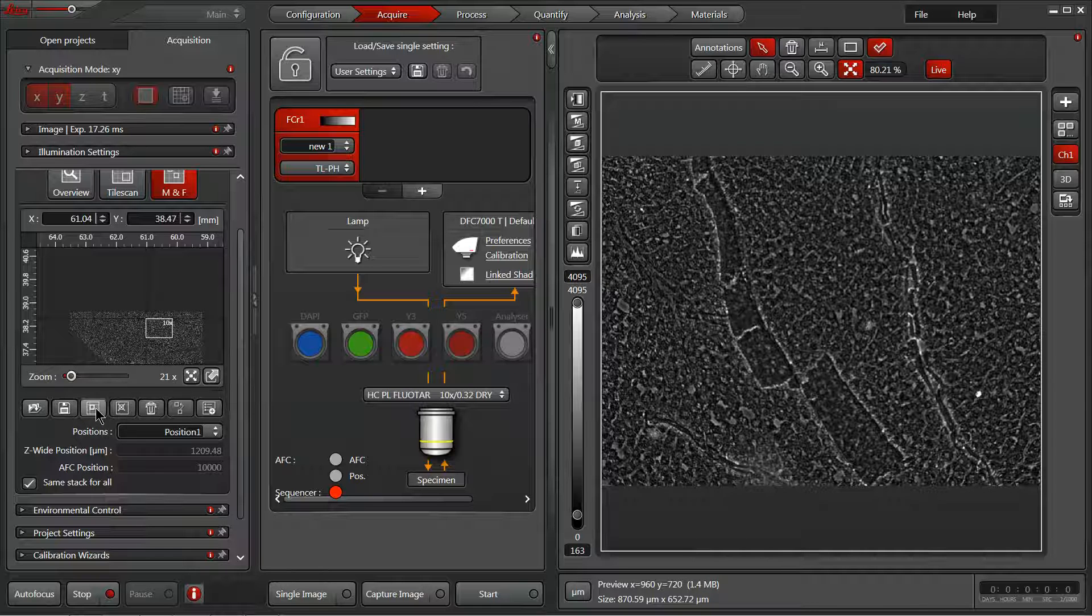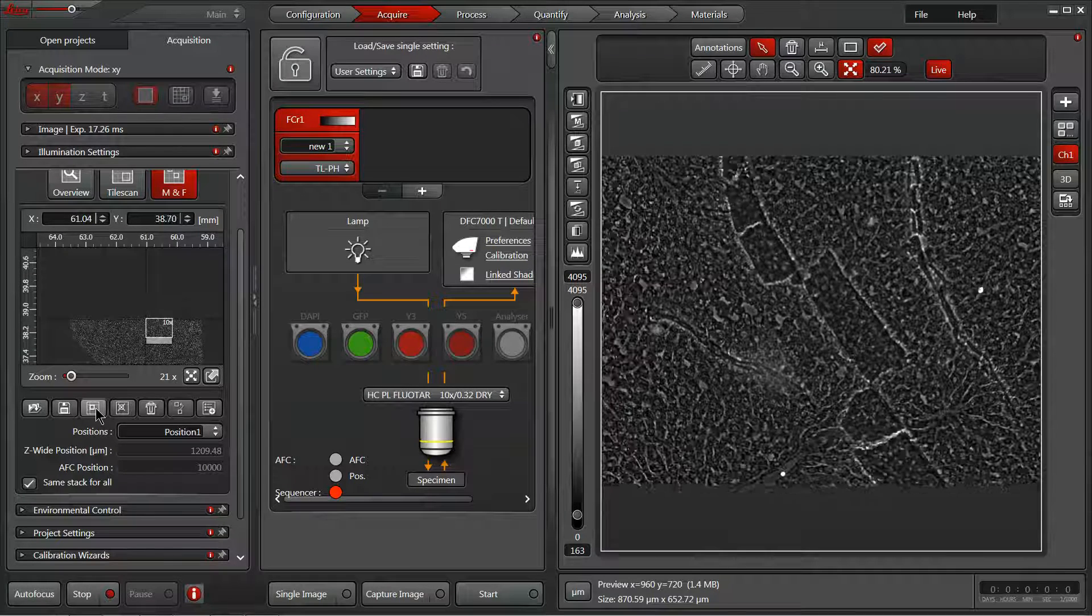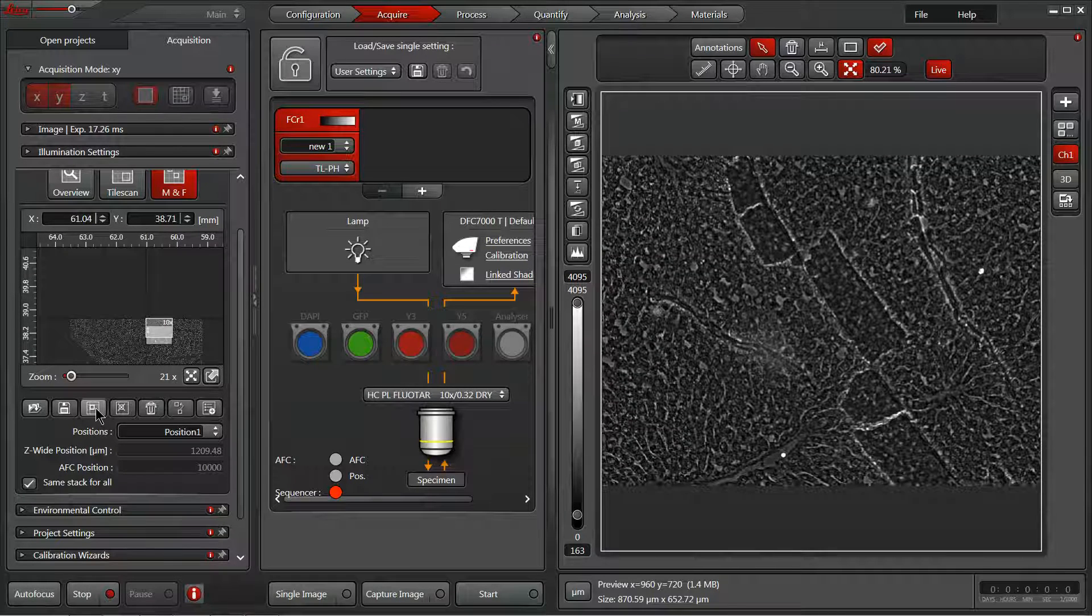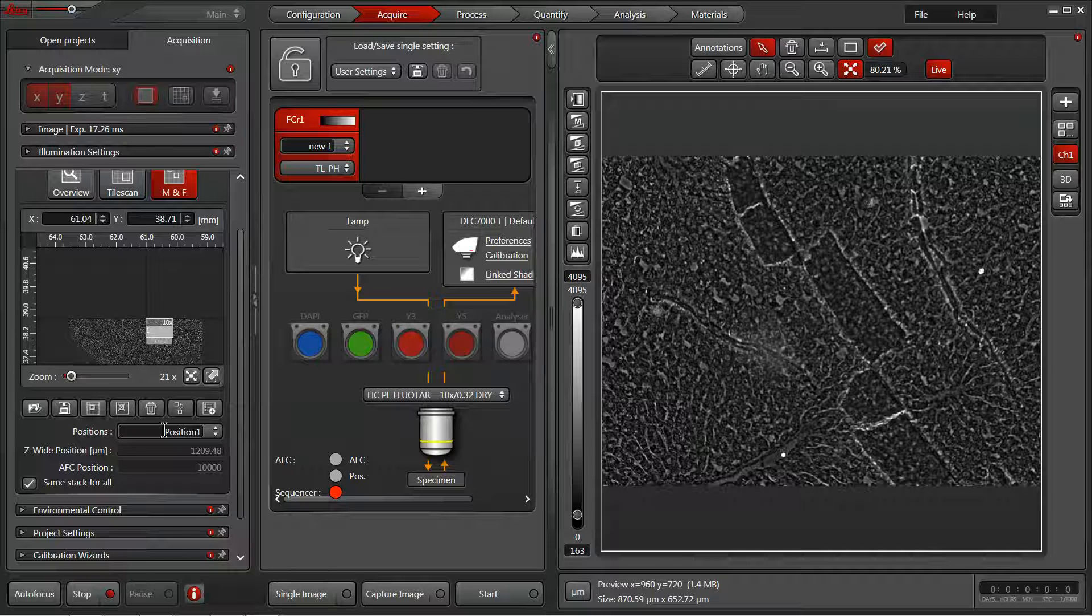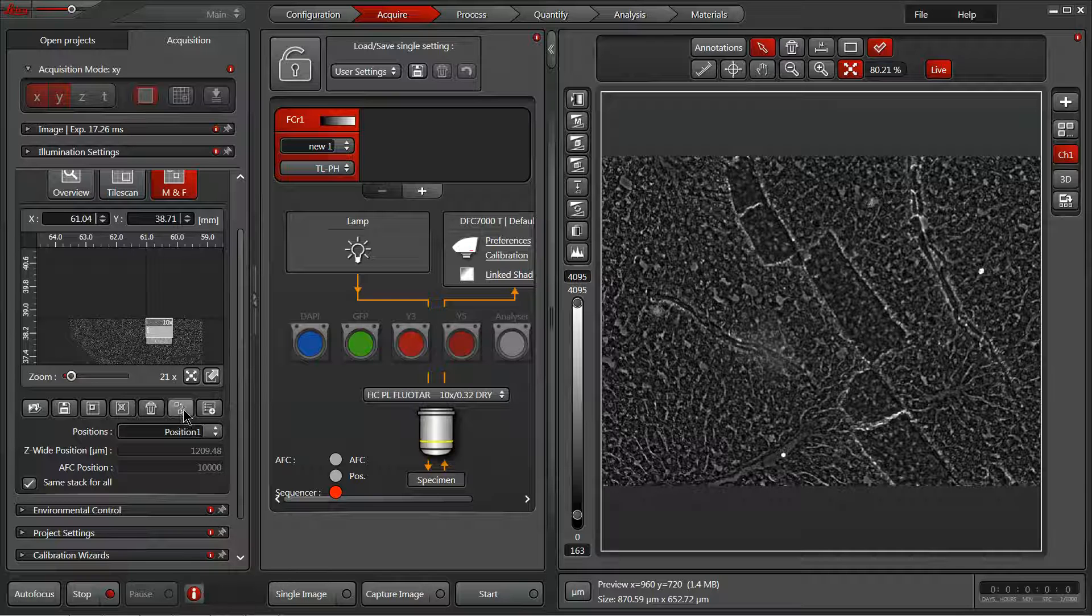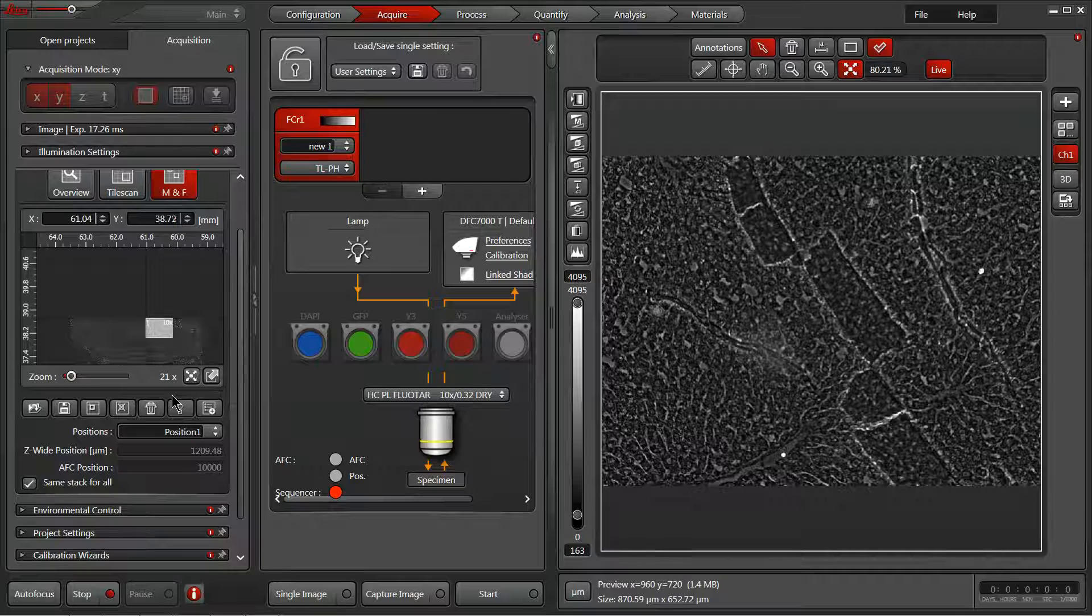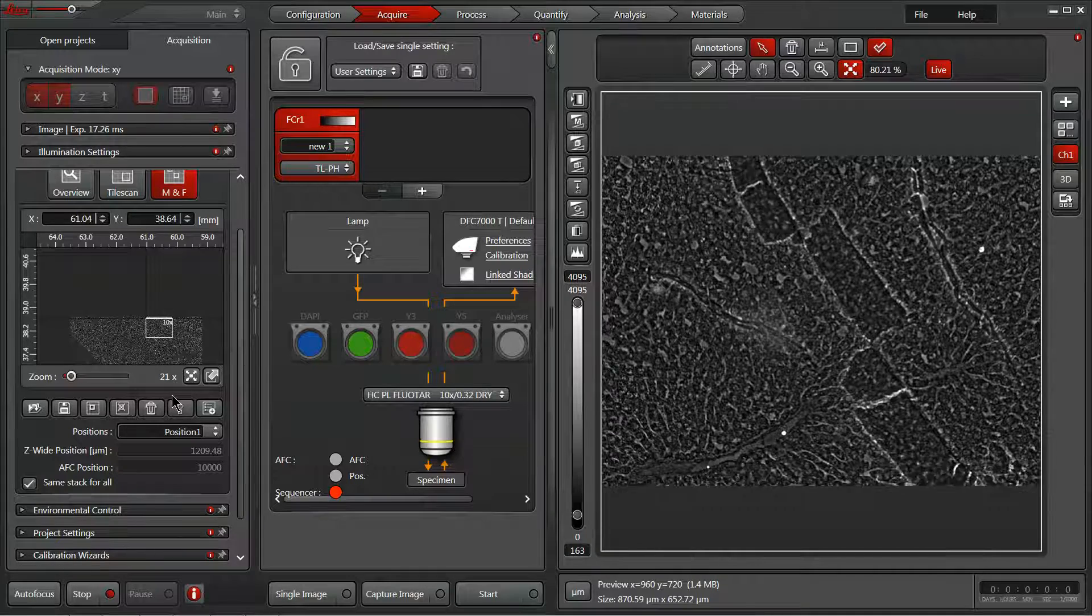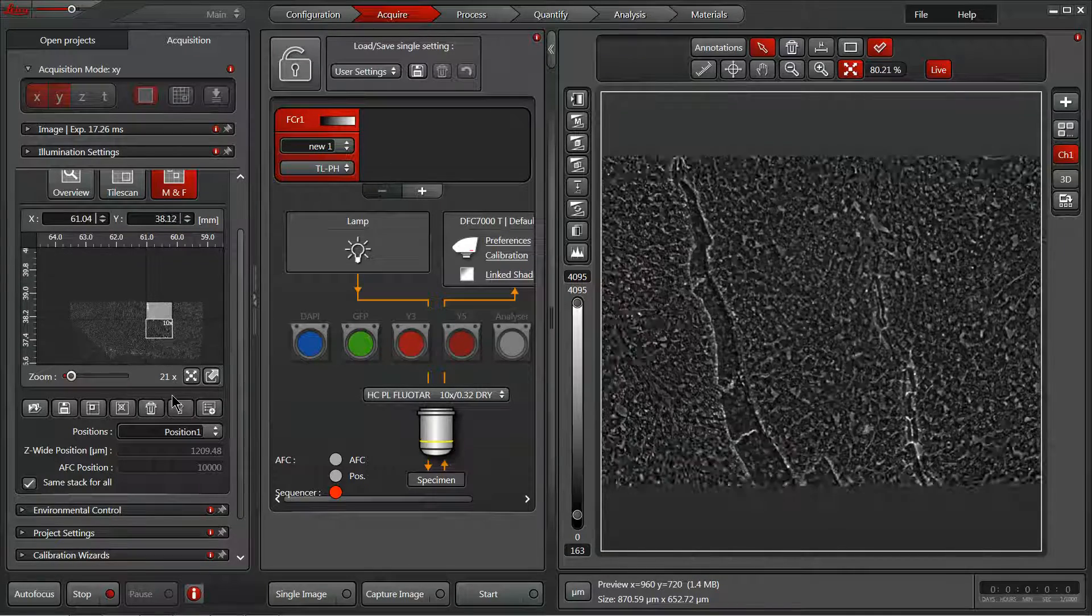And as I start to move, if I notice you know what, actually this is a little better position, you can redefine position one with this redefine position button, the square with an arrow up to another square. By redefining position one, it will have deleted and recreated a new position all with one click instead of us having to click several times.